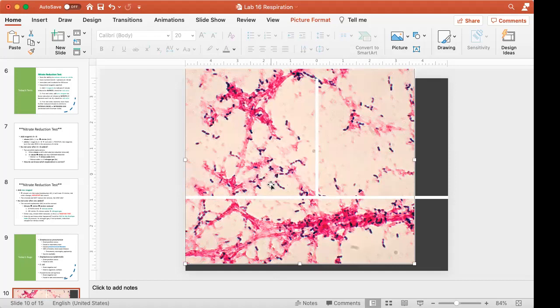Check right here. See it? See that organism? It's stained dark, it stains purple with this particular stain that's being used. Here's a group of 2. Here's a group of 2. Here's this one that I pointed out earlier is 1, 2, 3, 4, 5, 6, maybe 7 cells.